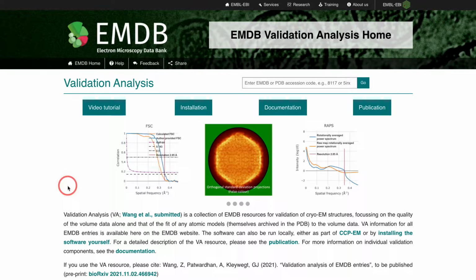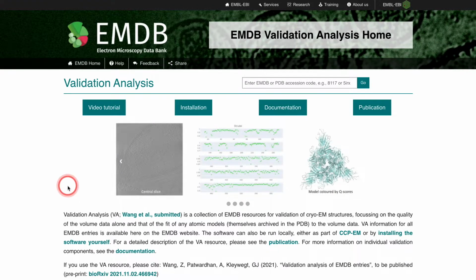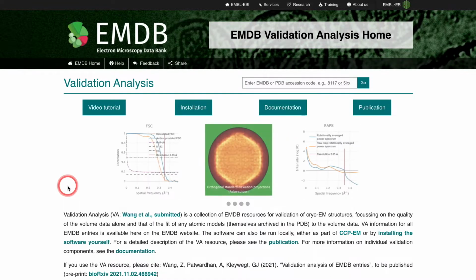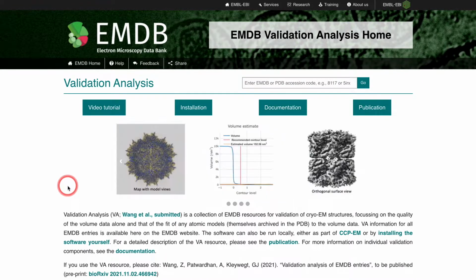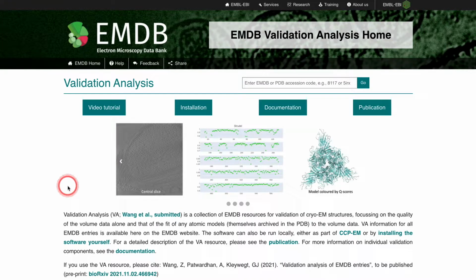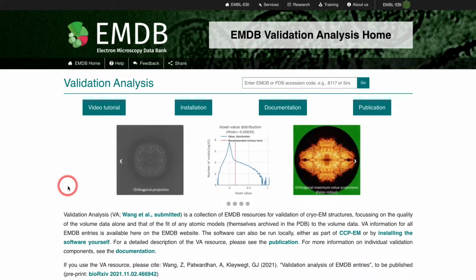Hello and welcome. In this video, I'm going to be covering the validation and analysis pages on the EMDB. To get to the validation analysis pages, you can either travel directly to ebi.ac.uk/EMDB/VA. There will also be a link on the EMDB homepage that allows you to travel directly here, or you can travel directly to the validation analysis page for a specific entry via the entry pages on the EMDB website. I'll be showing you how to do that in this video.